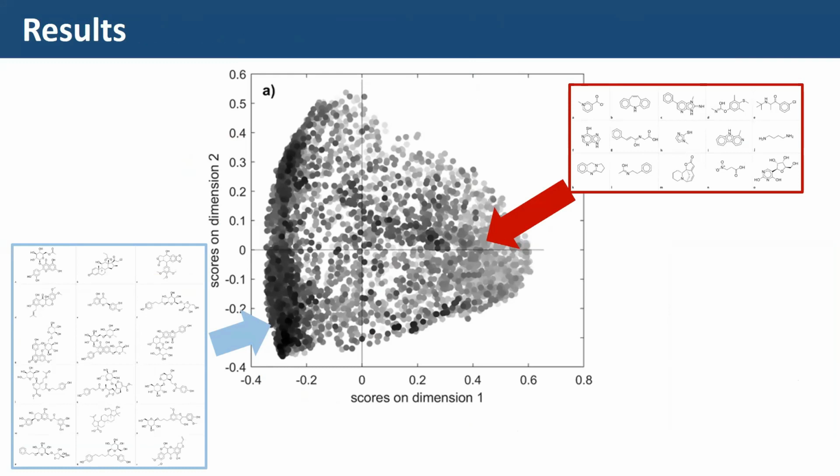Yeah, it could be. This is just a small set which I sampled from the two areas. So to confirm this, I should extend this type of analysis to the rest of the area. Inside here there are 5,000 points. But yeah, it could be.